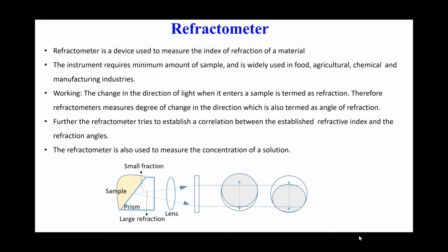reflection of the light. Using an optical refractometer, we can simply put a few drops of the sample liquid on the angled prism, and then we seal it with a plate so that there is no interference from outside, and take the reading for that. We will look at the same in the later part of this video.